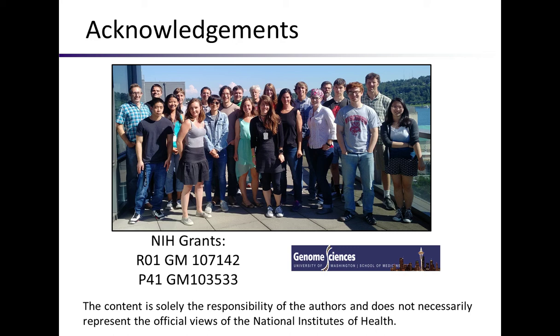Why do you use both peptides and proteins in your internal standard? Yeah, this is a really good question. Both are in the internal standard because they bring different things to the table. Peptides, you should always see.